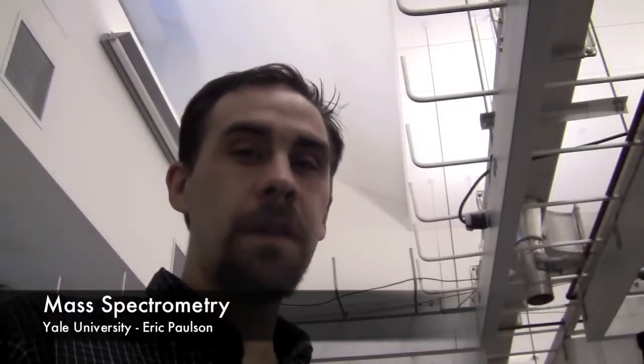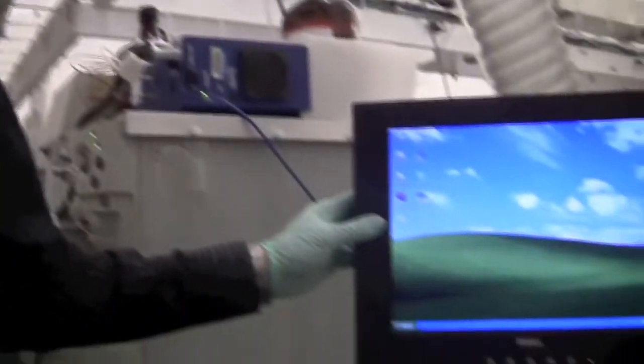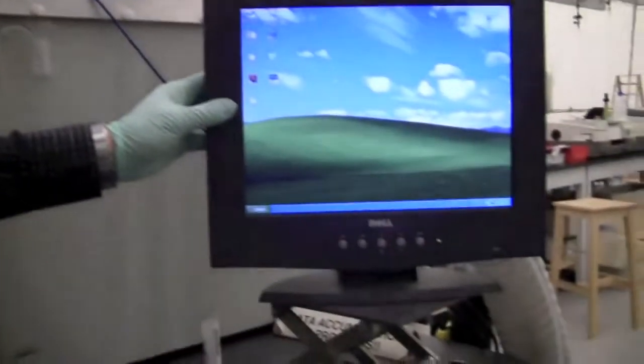This is a demonstration of how to use the ZQ mass spectrometer with the DART source. So when you come to the instrument, everything may be closed.